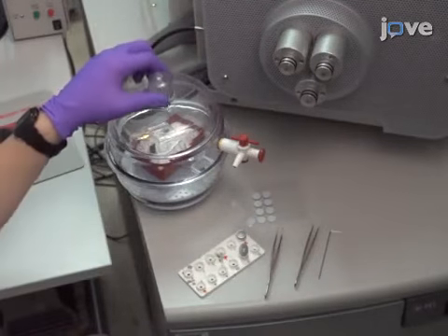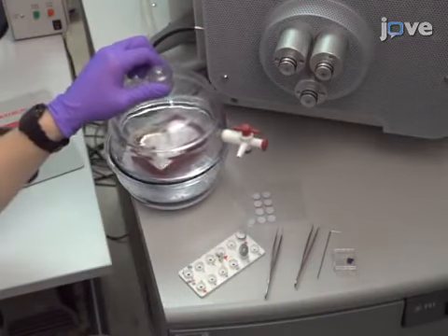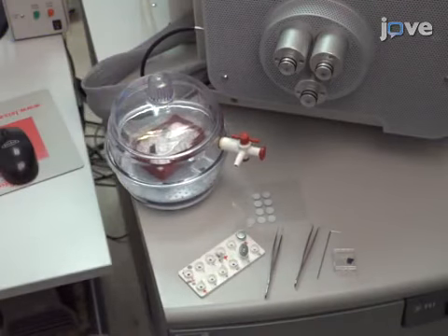Prior to beginning the procedure, grow nanotube forests in thermally oxidized silicon wafers coated with alumina and iron.